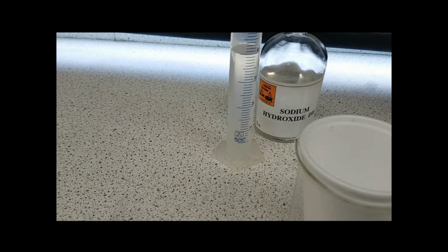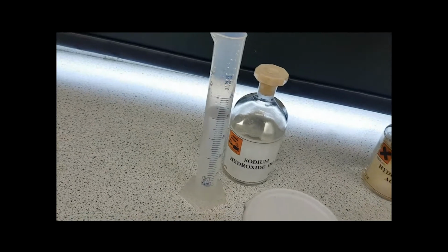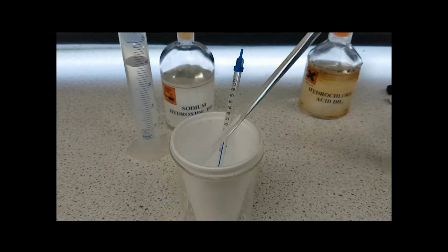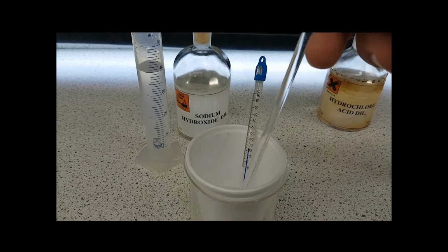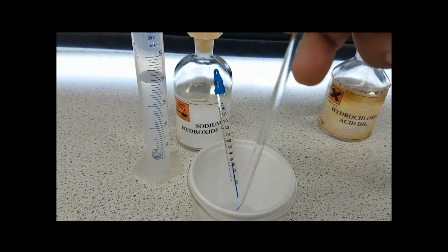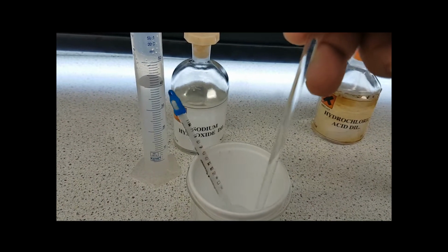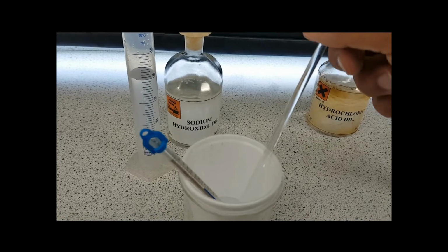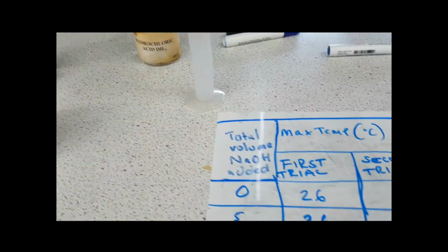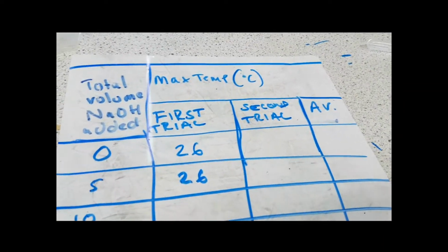Then you're just going to let it settle, so that we can get an average reading of the temperature. So put your thermometer in and just stir, because you're not mixing anything. Stir for a while, just so that it can settle out. I'll do it for about a minute. And once you've let it settle out for a minute, you record your results. Okay, so you'll take your reading.